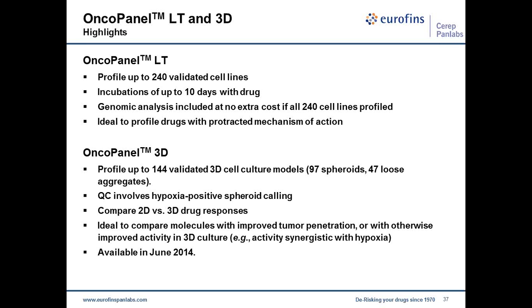I should point out that due to the differences in the ability of drugs to penetrate tumors, and that difference is cell line specific, we actually don't think that 3D is suitable for biomarker discovery. So the 3D cell culture offering is probably better going to enable a comparison of compound effects rather than identify genomic biomarkers.